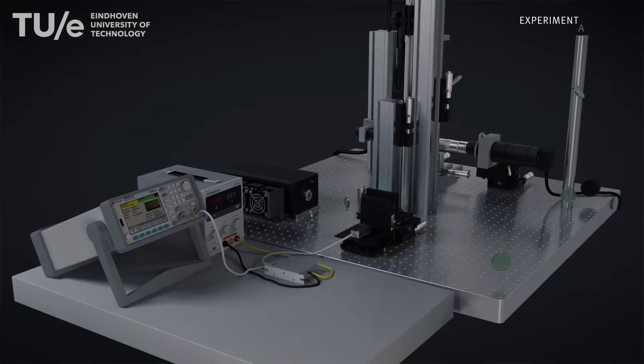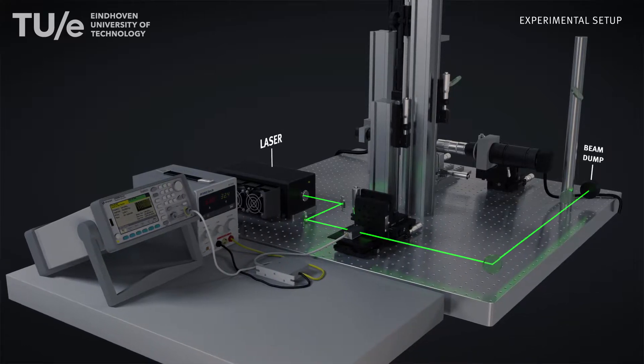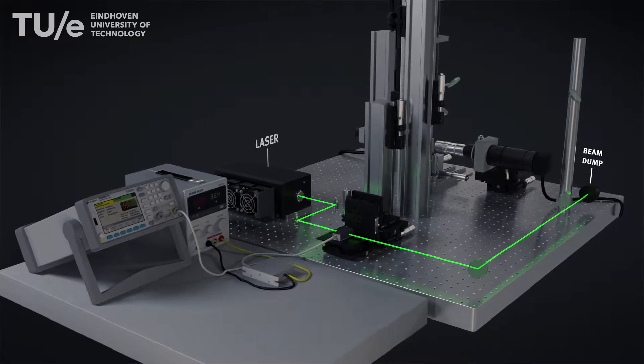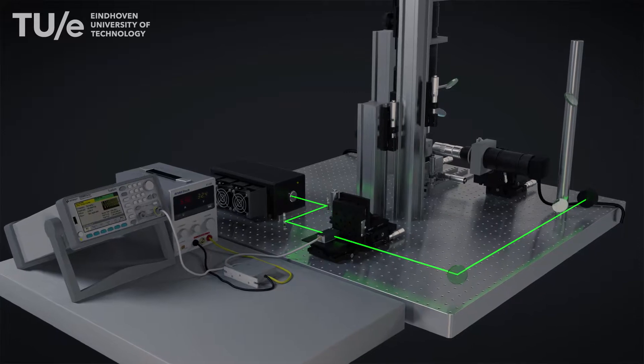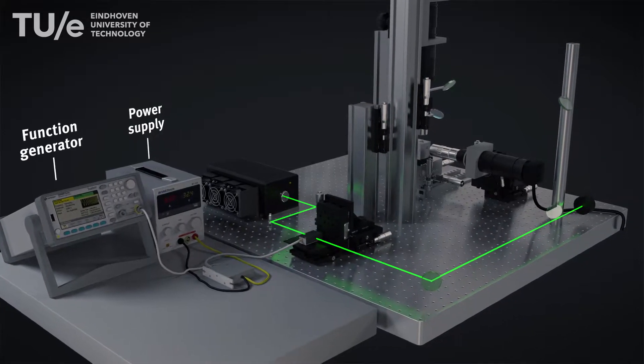Researchers at Eindhoven University of Technology have developed a device which allows real-time study of selective laser sintering of polymer particles.